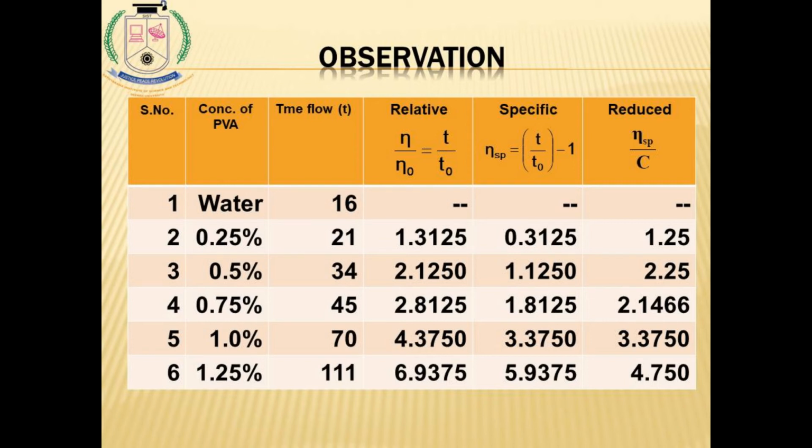Now we are going to draw a plot between eta SP by C versus the concentration of the polymer, as we have seen in our basic principle equation, the Mark-Houwink equation.